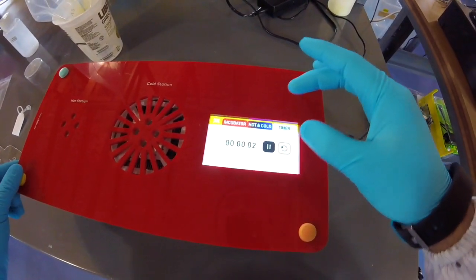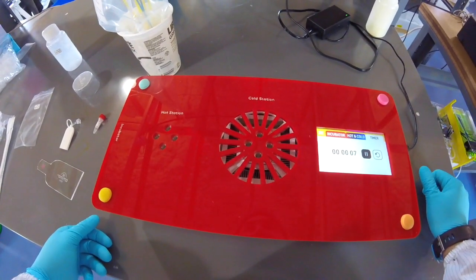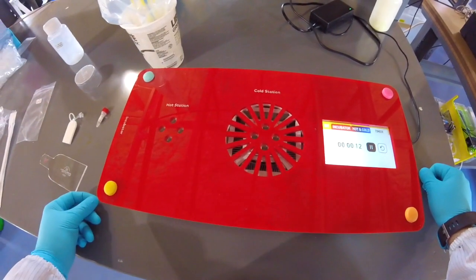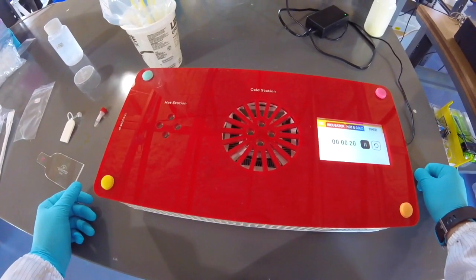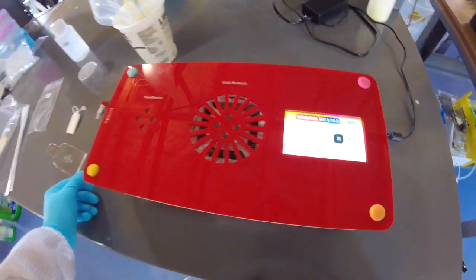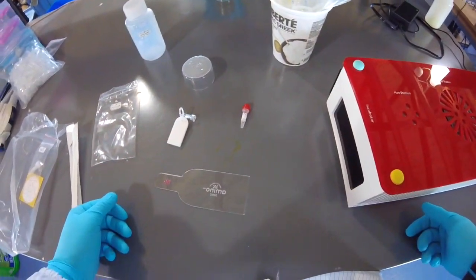So it's going. Now these cells should grow and divide, and you should start to see them in less than 24 hours. They'll be small colonies. You may start to see them changing colors around 24 hours, but definitely wait 48 hours to really see them grow into larger colonies and change color.